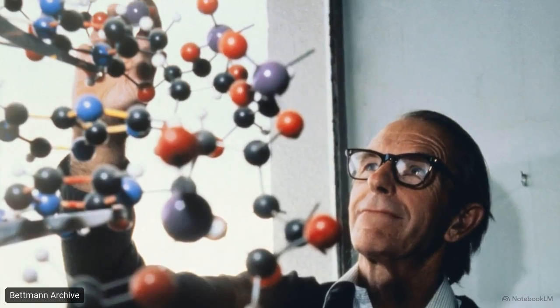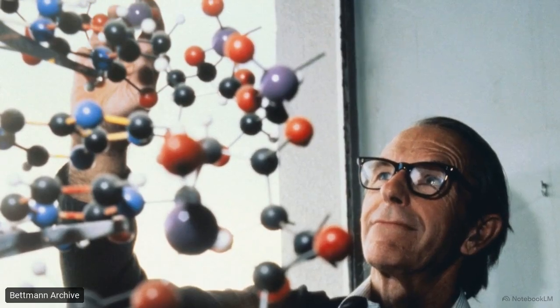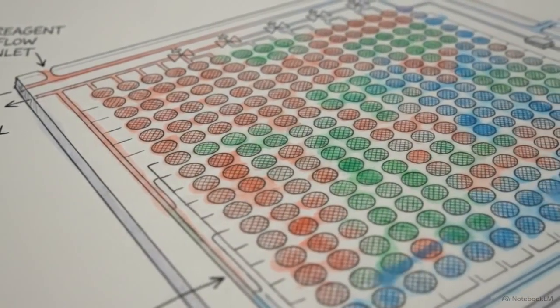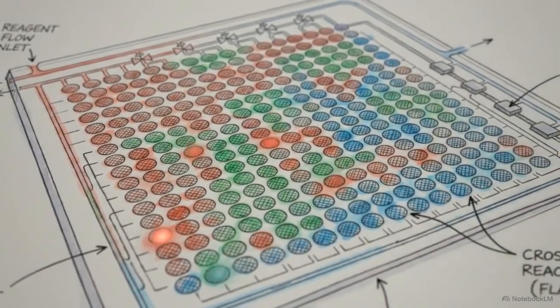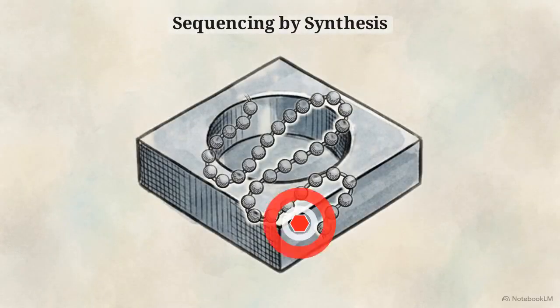Understanding the architecture of DNA originally required researchers to build physical, three-dimensional models to visualize the shape of the genome. Modern next-generation sequencing left physical models behind. The industry baseline systems infer a sequence optically, tracking synthesis byproducts by flooding a flow cell with fluorescent dyes and photographing the flashes of light as new nucleotides attach.